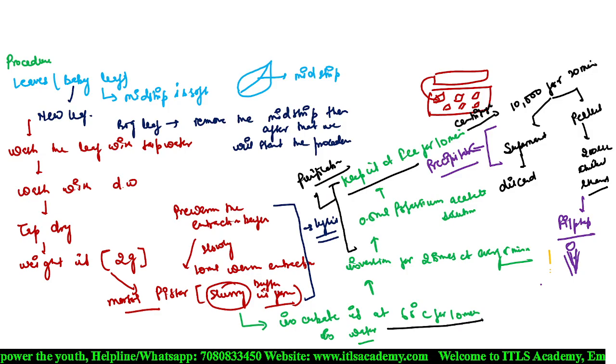Then after that, again you have to centrifuge at 8,000 RPM for 10 minutes.